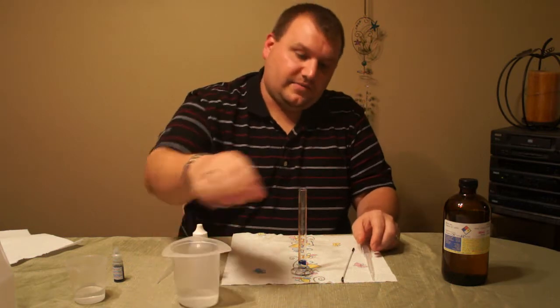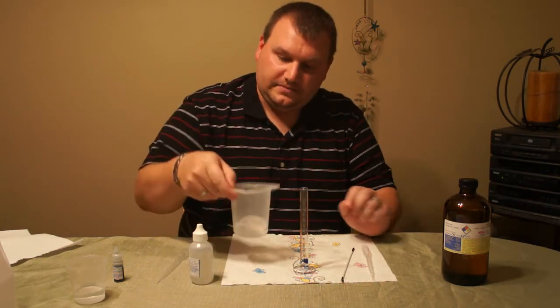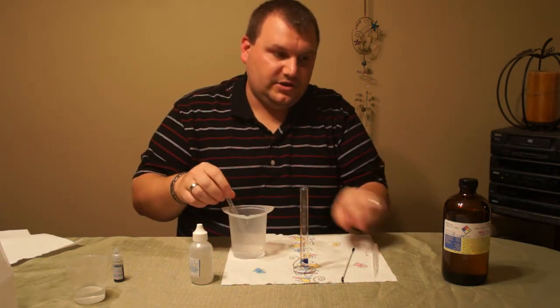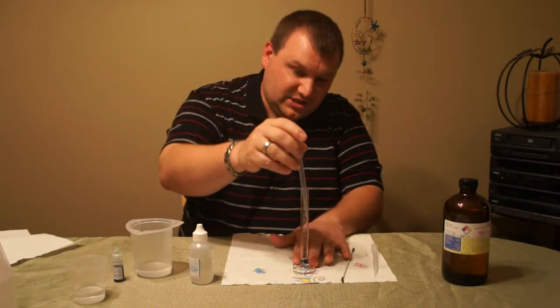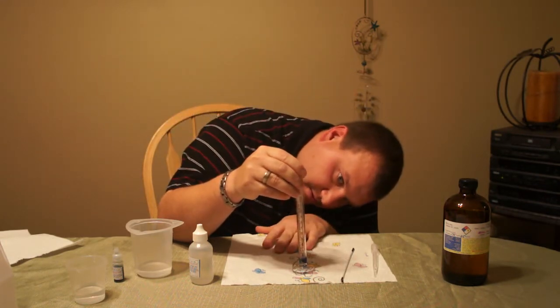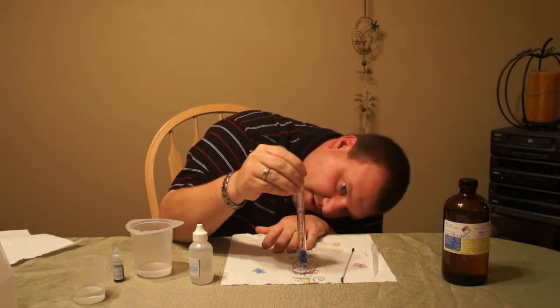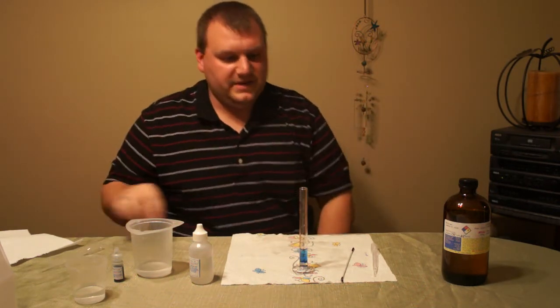Now you're going to want to fill up the graduated cylinder to the 3 milliliter mark. I'm using a different pipette, but if you use the same pipette that you used with your nicotine, make sure it's rinsed out well because you don't want to introduce additional nicotine into the solution — otherwise your results will be off. I'm going to put it to the 3 milliliter mark, at the bottom of the meniscus.